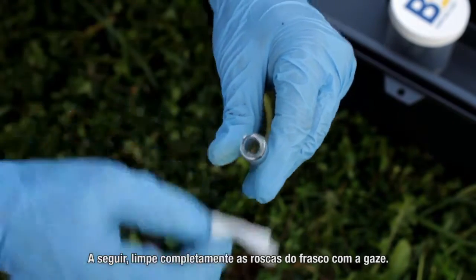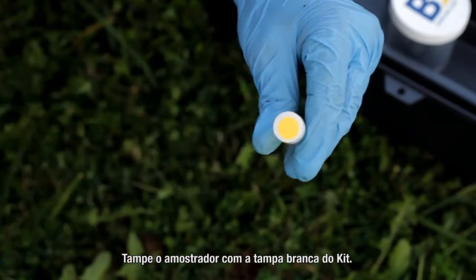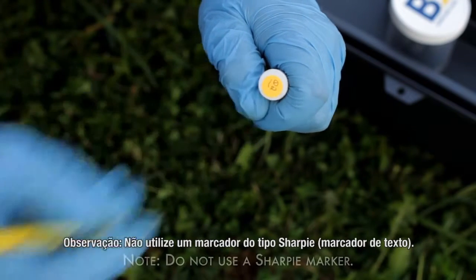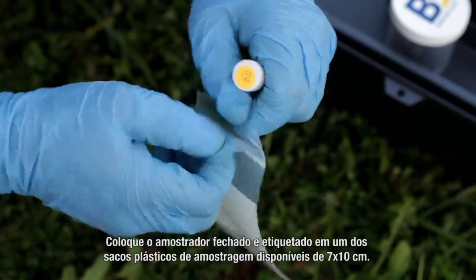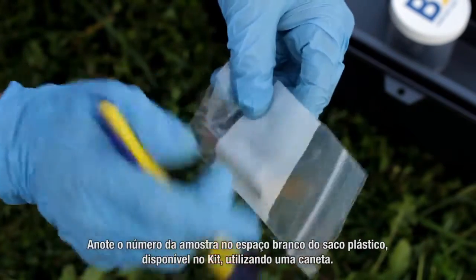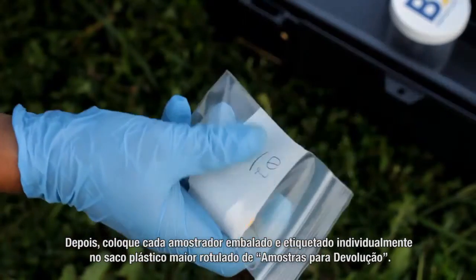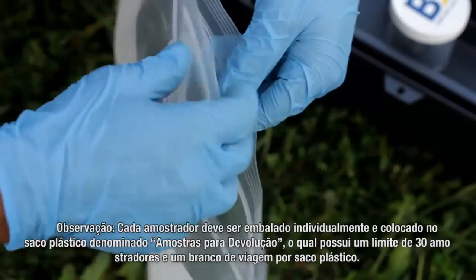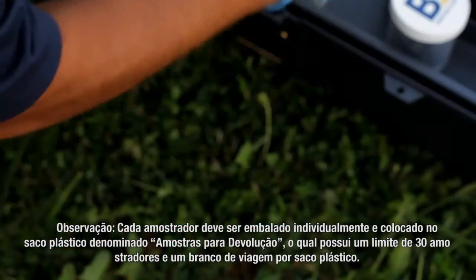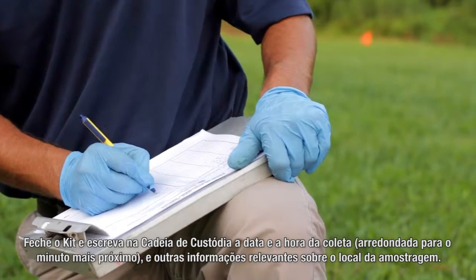Next, clean the vial threads completely with the gauze cloth. Take the solid shipping cap from the kit and screw it onto the sampler. With a ballpoint pen, record the sample number ID corresponding to the sample location on the cap's label — do not use a Sharpie marker. Place the sealed and labeled sampler in one of the provided 3 inch by 4 inch plastic sampler bags and record the sample number on the white block using a ballpoint pen. Then place the individually bagged and labeled sampler into the larger bag labeled return shipment bag. Note: each sampler is individually bagged and placed in a return shipment bag with up to 30 samplers and one trip blank per return shipment bag. Close the kit and on the chain of custody record the date and time of retrieval to the nearest minute and other relevant information for that sample location.